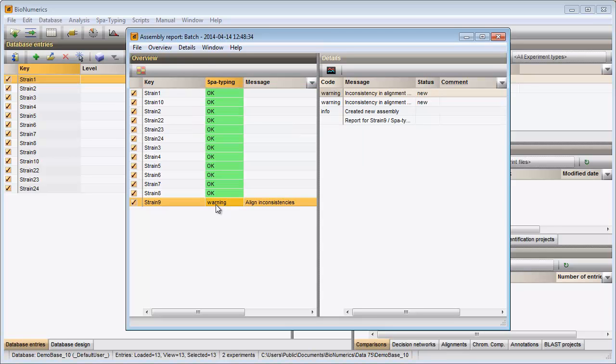When I click on the cell, the details are updated in the details panel on the right-hand side. I can open the assembler window by double-clicking on a warning message.